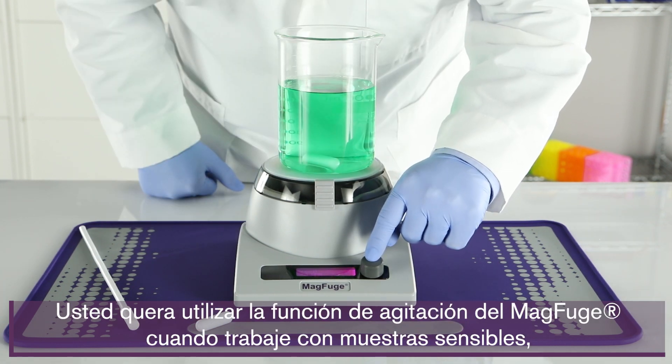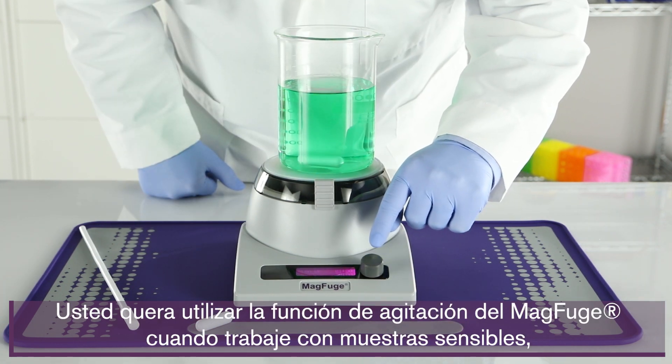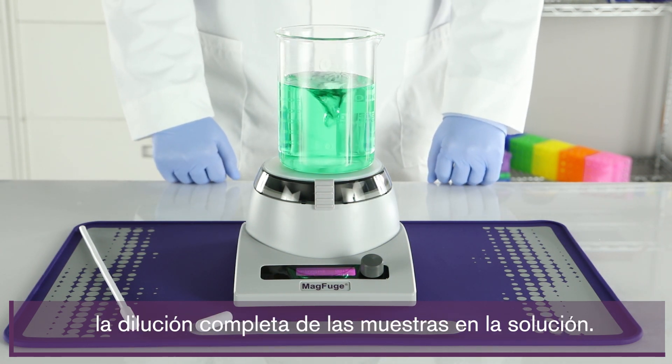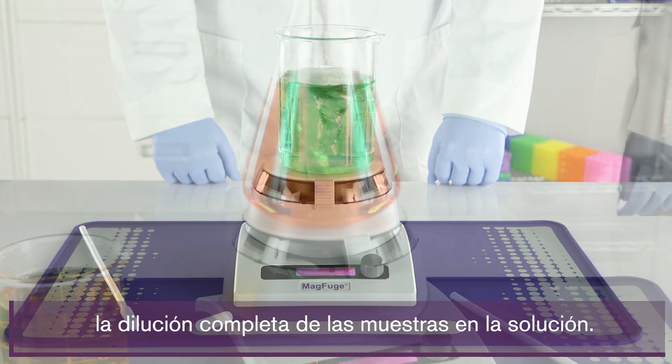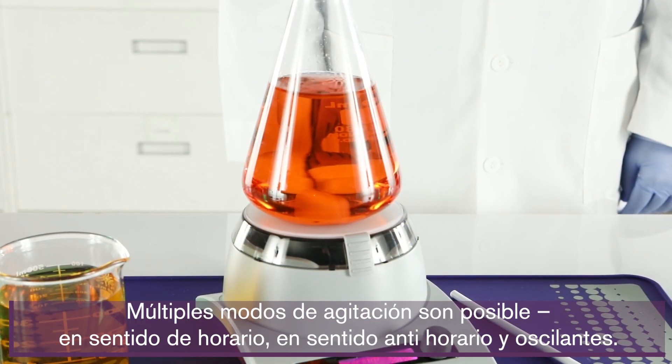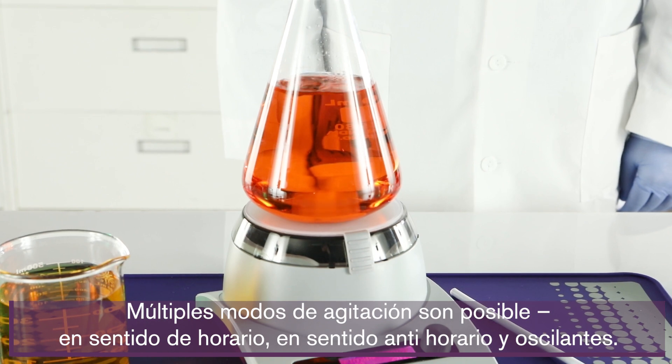You'll want to use the MagFuge's stirring function when working with sensitive samples such as cell lines, and for protocols requiring more aggressive mixing to quickly achieve full dilution of samples in solution. Multiple stirring modes are possible: clockwise, counterclockwise, and oscillate.